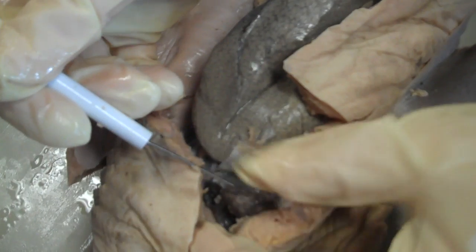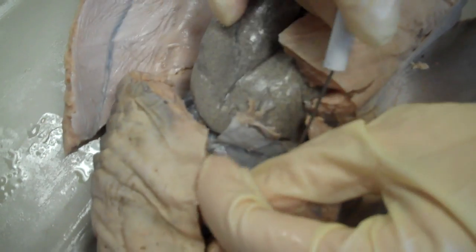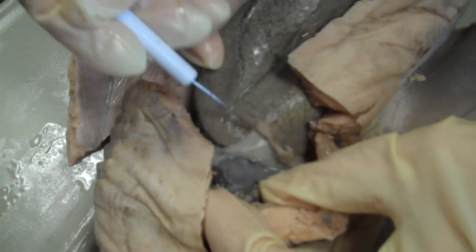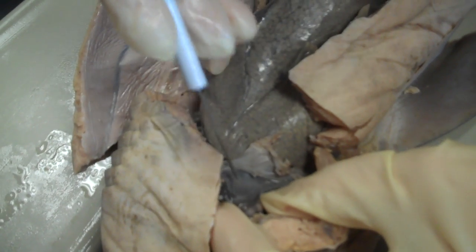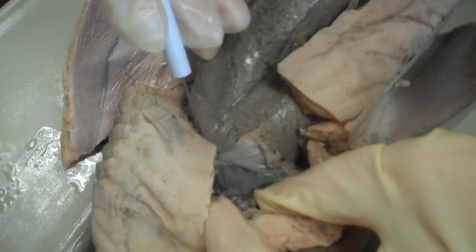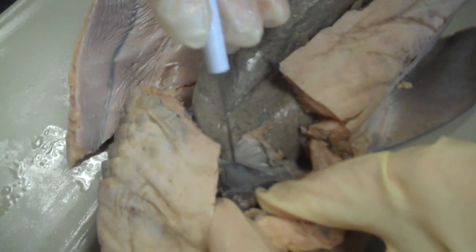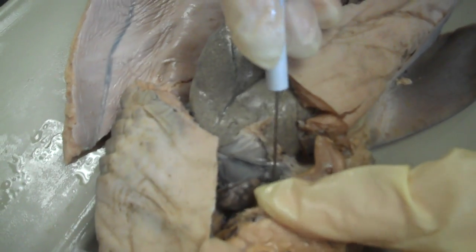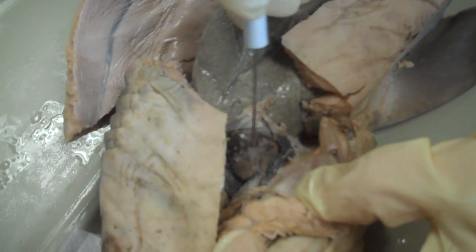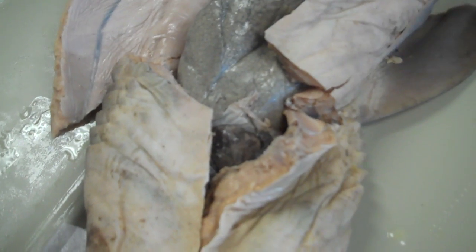If you lift up the ventricle underneath, you find this triangular region here. This is the sinus venosus. So all of this deoxygenated blood from the body pulls in the sinus venosus. That leads to the atrium, atrium to the ventricle, and then ventricle to the conus arteriosus.